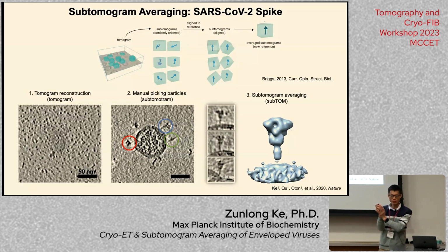So you get a blob with a membrane and a blob on this side. I use that as my initial reference. Then from there, you can use that blob to do alignment of these 60, and then you get that blob, and from there you keep going. Sounds great. So it's all starting from the data. Yes, everything is from the data.